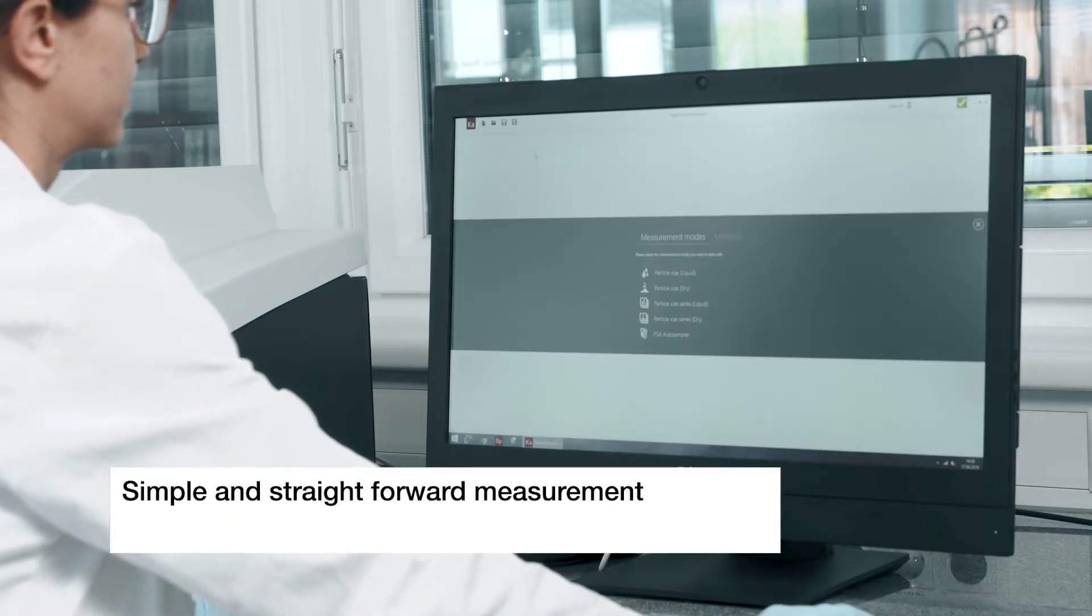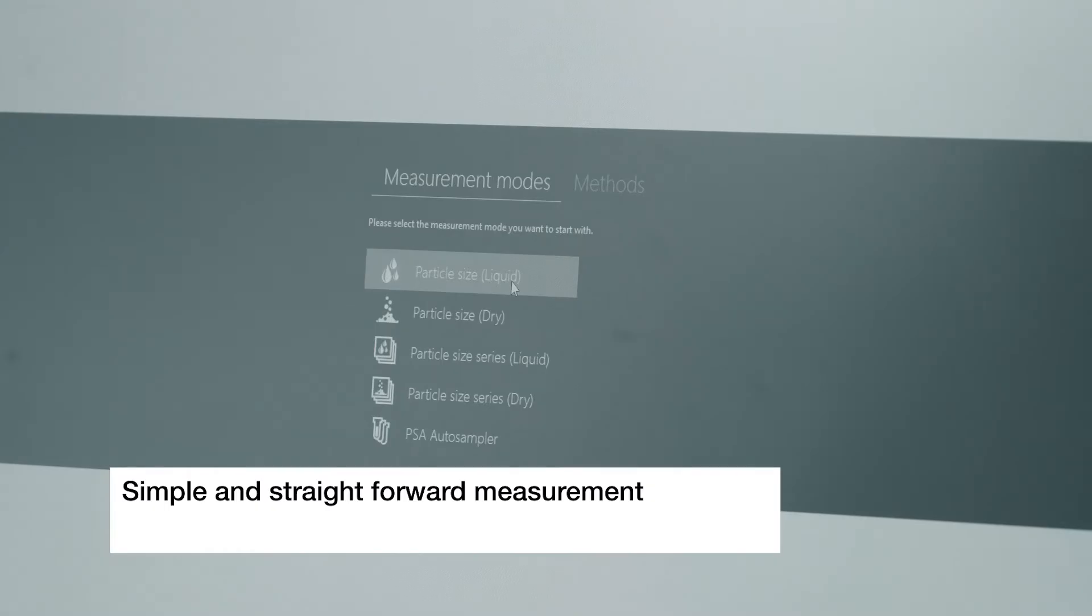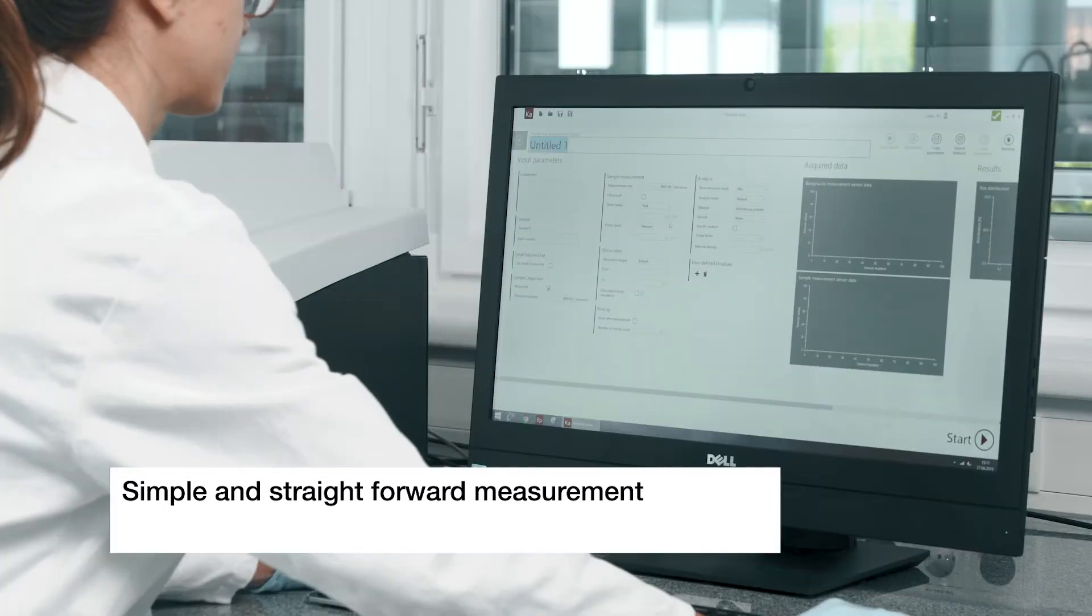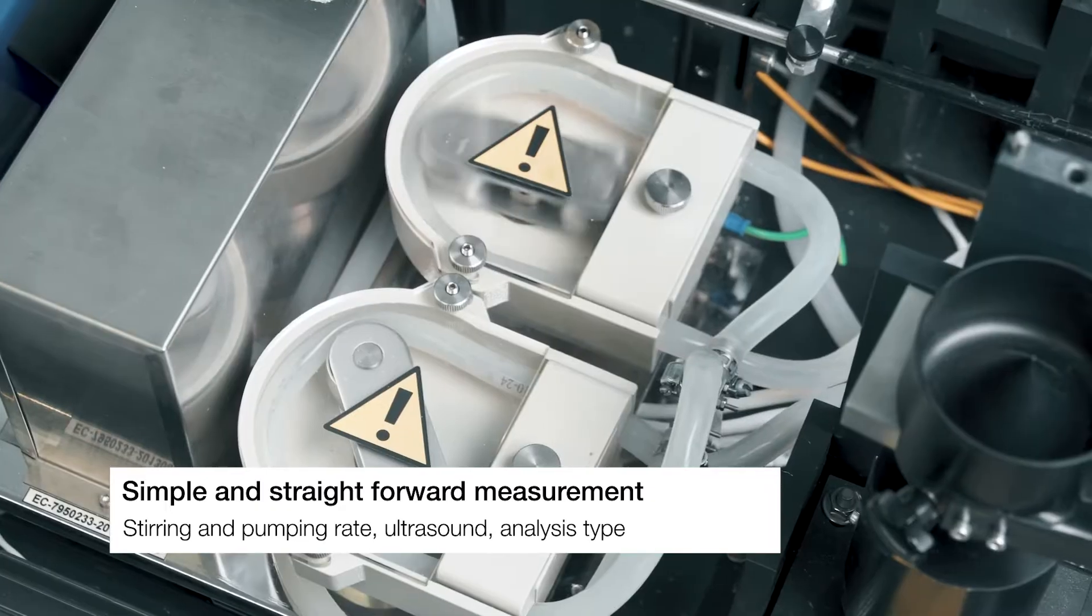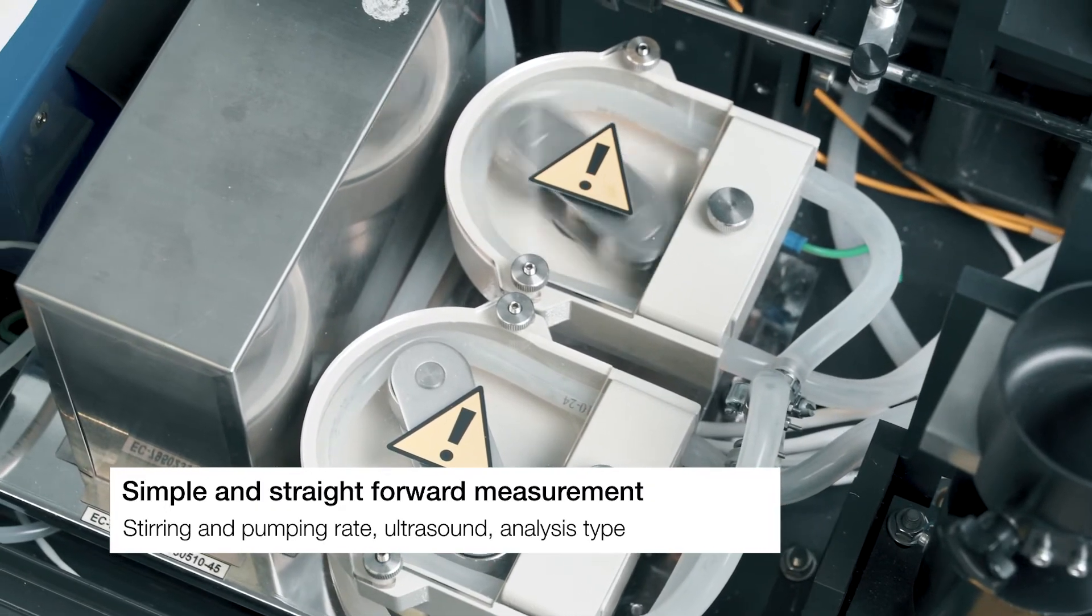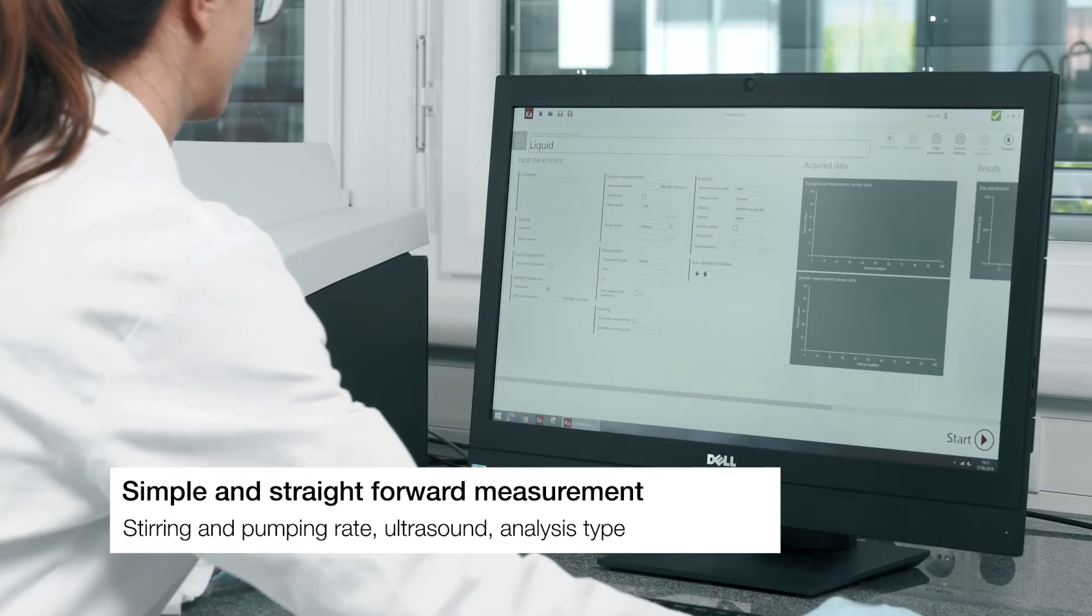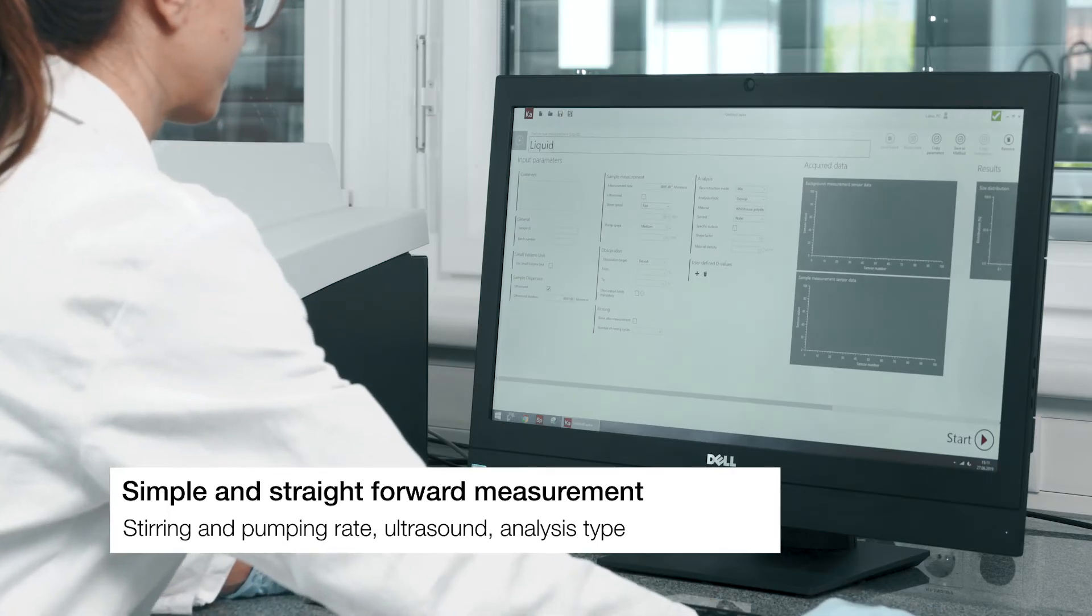The measurement is set by choosing the basic parameters in the Calliope software. Those parameters include dispersion settings like stirring and pumping rates and the ultrasound, analysis type, and others. All of those settings and more are on the same screen, allowing for an easy setup.